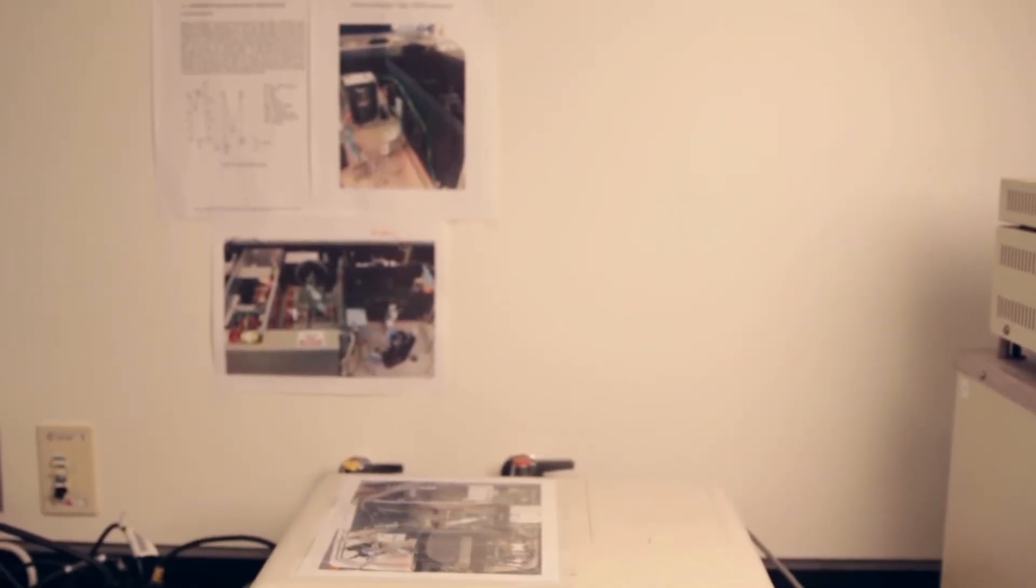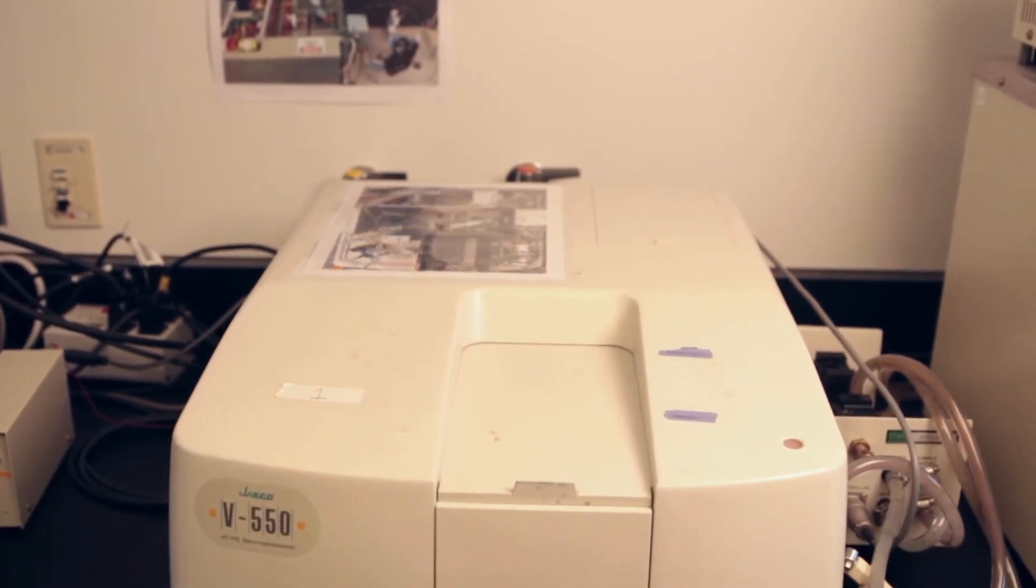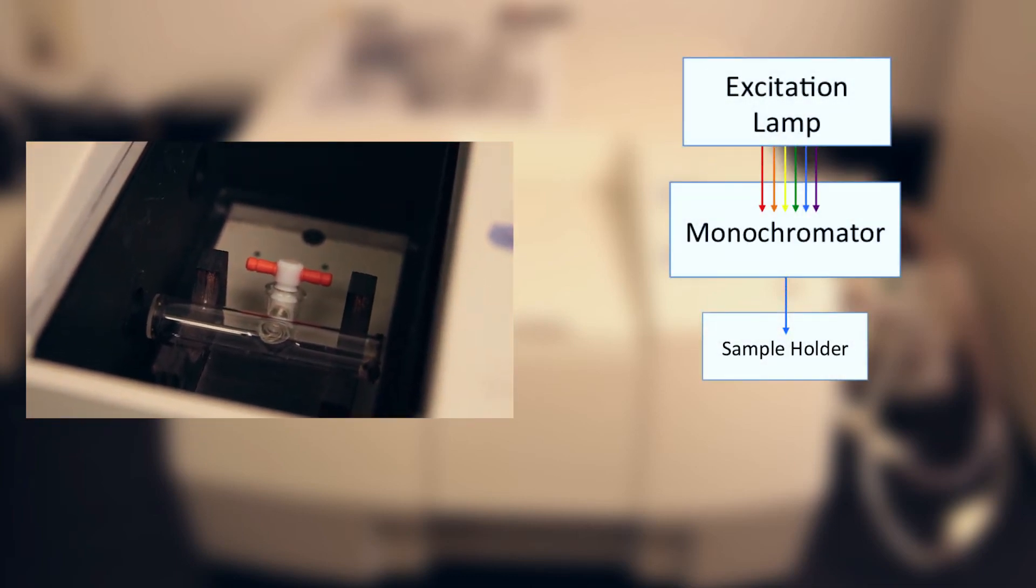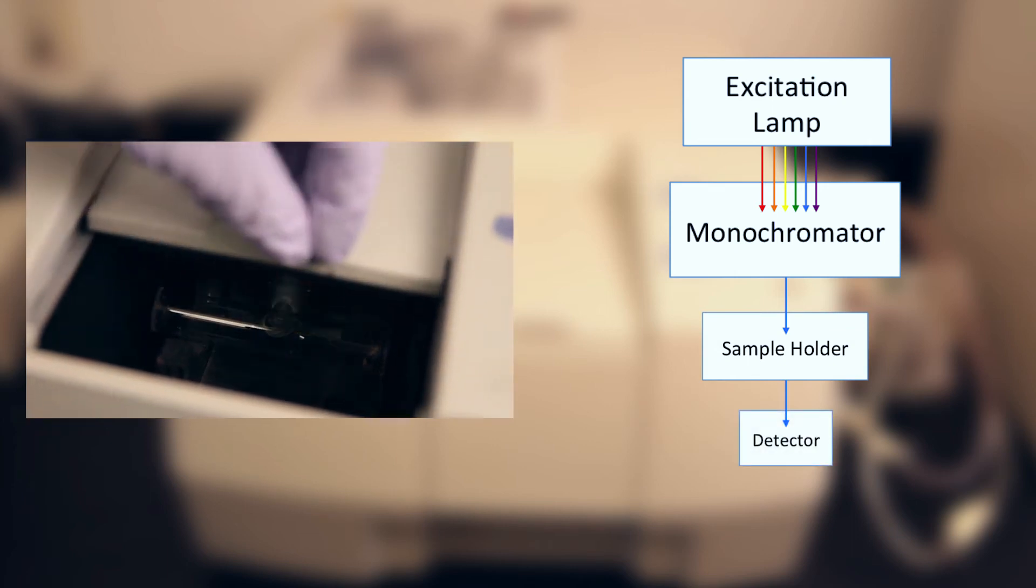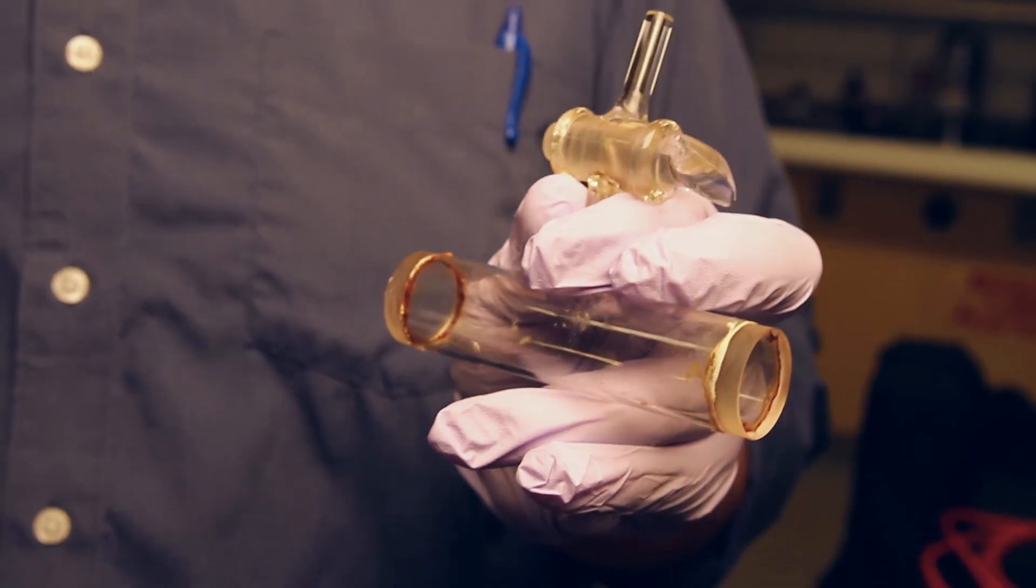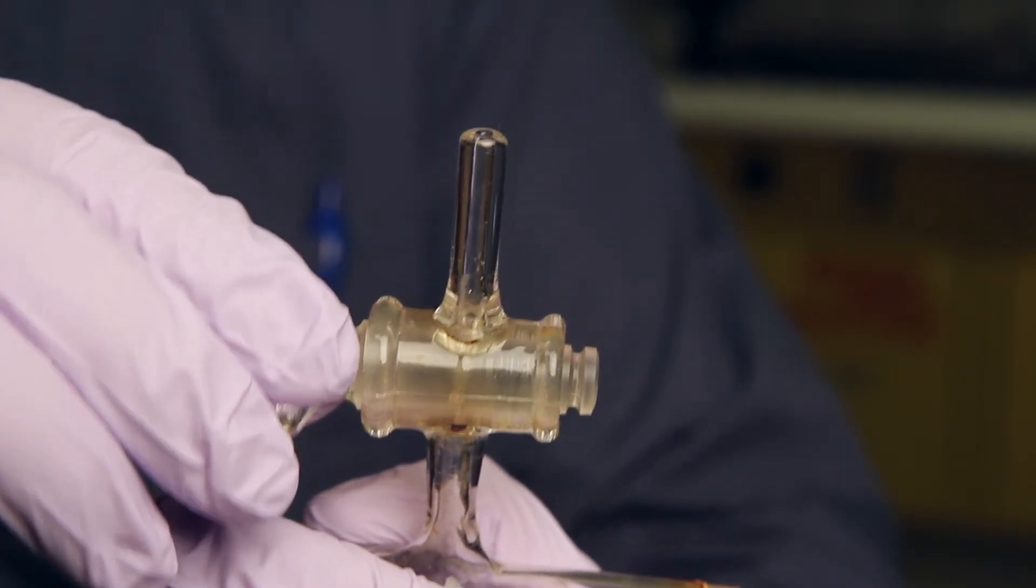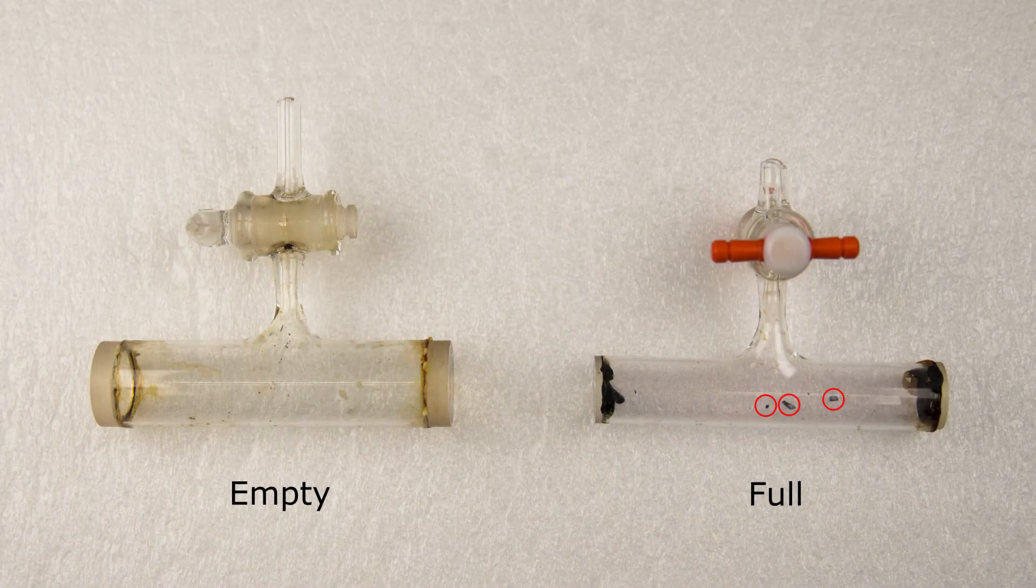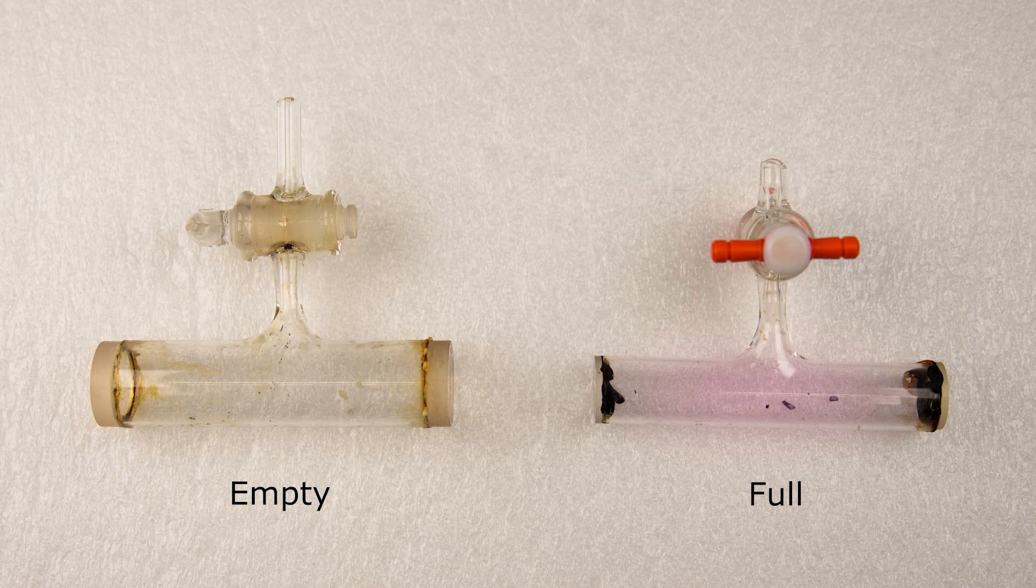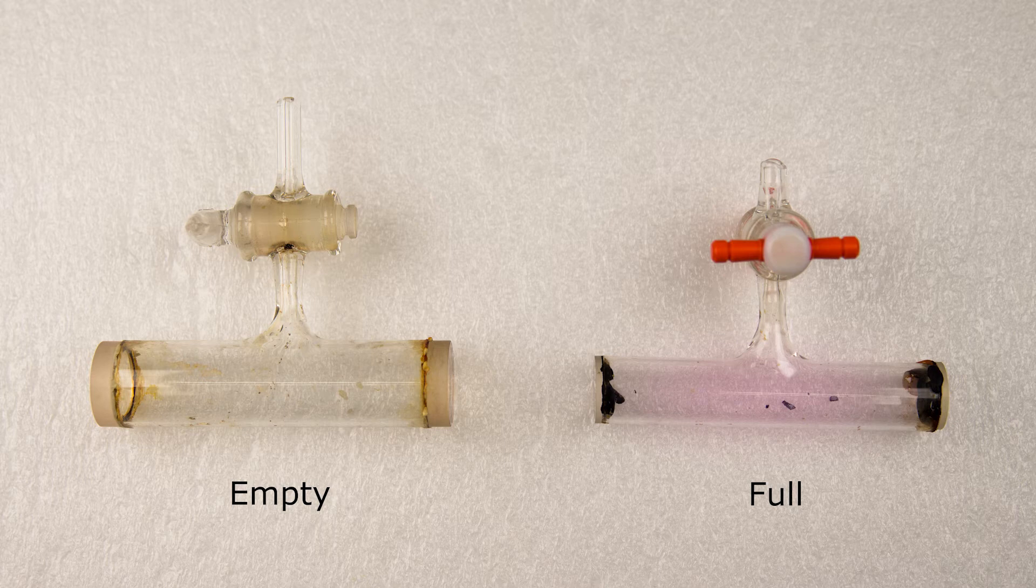In this experiment, you will record and analyze the absorbance and emission spectra of iodine. The absorbance spectrum will be recorded using a standard UV-Vis spectrometer, but the sample cell is not the standard square cuvette that you have used in previous experiments. We're probing a molecule in the gas phase, and gas phase molecules are less dense than in the solution phase, so we need a much greater path length in order to observe an appropriate instrumental response. This is in accordance with the Beer-Lambert law. The sample cell shown here is 10 centimeters long, has quartz windows, and it can be closed to the atmosphere with a stopcock. A few iodine crystals will be placed in the cell prior to your arrival in the lab. This will allow the iodine to sublime and equilibrate. After several hours of equilibration, a purplish color will be observed in the cell.